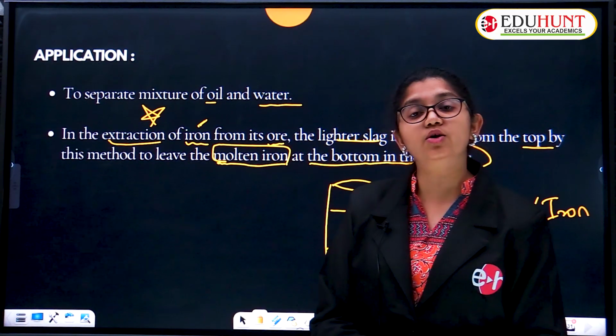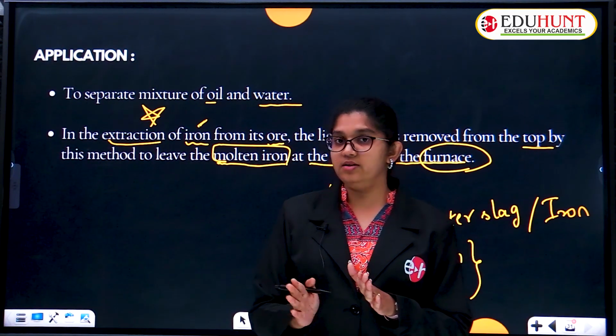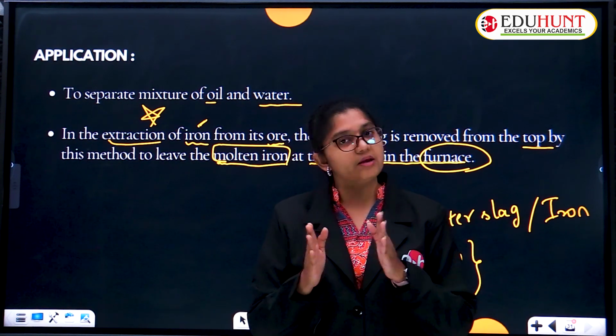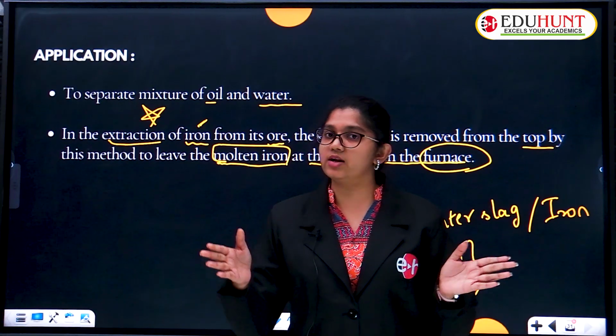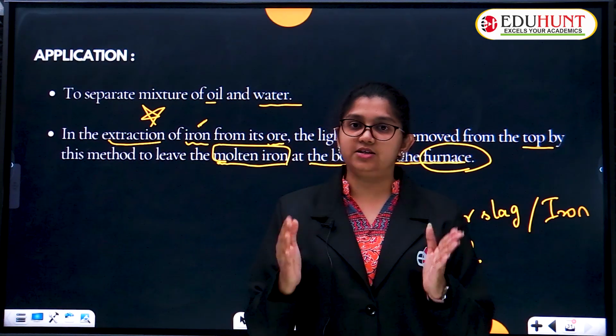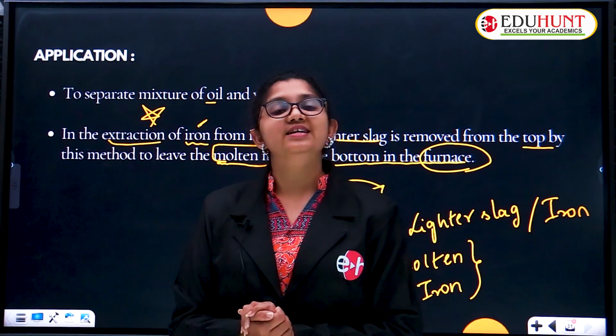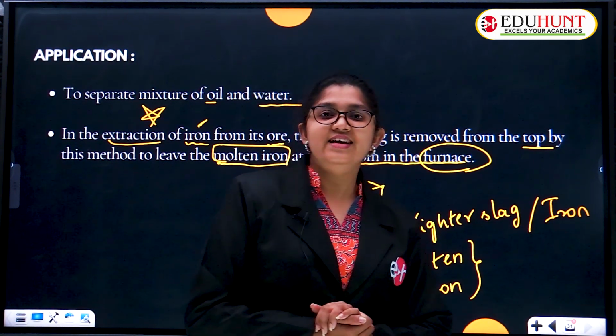Okay, this is all about the process of separating a mixture of two immiscible liquids, which do not mix together and have different densities, so they can easily be separated using a separating funnel. This is all about the separation of two immiscible liquids, children, in this session.